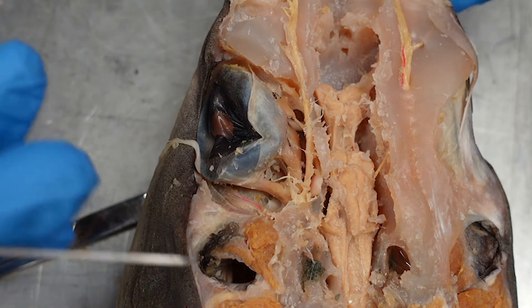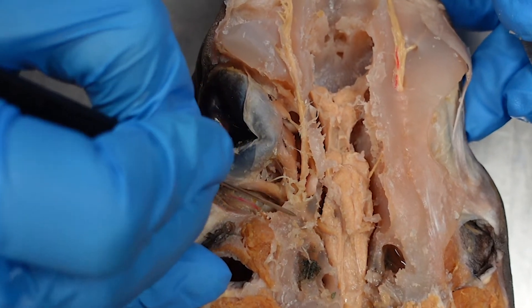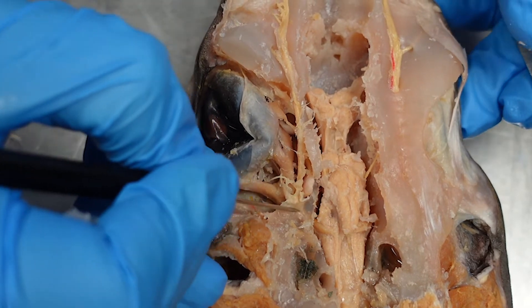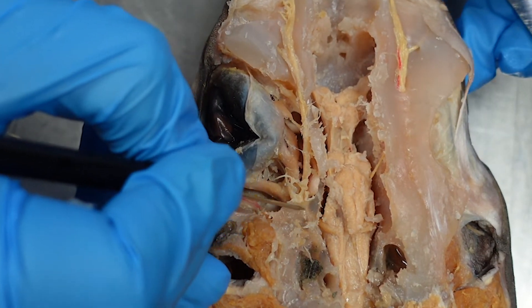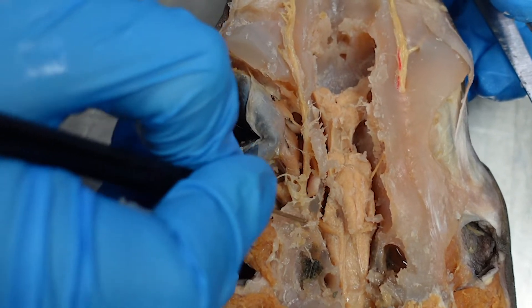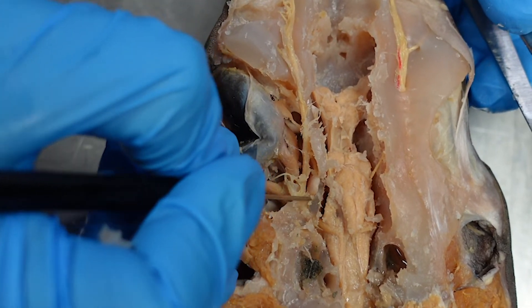If you're nervous about cutting down here, use your sharp probe to sort of pick away and soften the cartilage around where you can see the nerves passing through. You can see the superficial ophthalmic trunk passing underneath this thin layer of cartilage — you can actually just scratch at it and weaken the cartilage so that you don't risk the nerve when you pry it off.